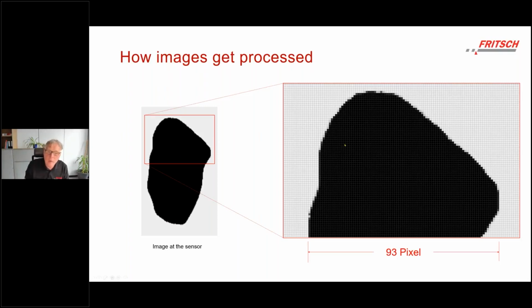And when we look closer at these images, of course, you can see the pixels. Each digital camera sensor consists of many, many pixels. The pixel size of our camera, the hardware in our system, is 3.45 microns. So this is a number you know very accurately.